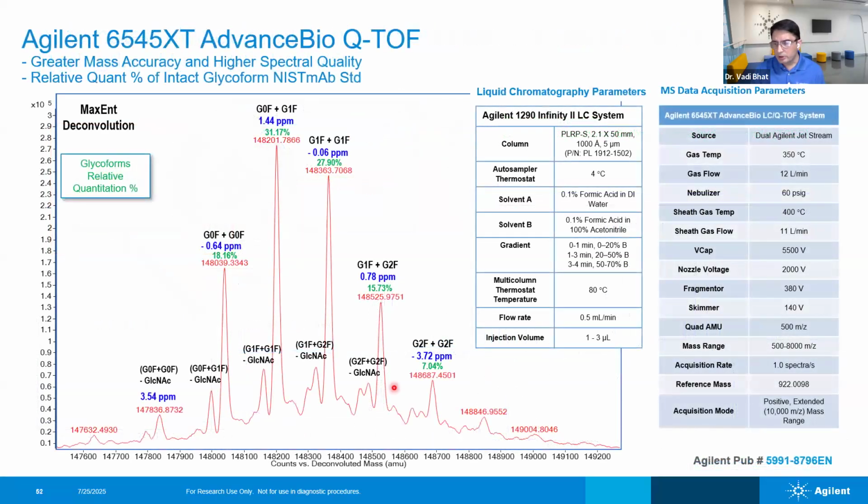Now, in the interest of time, I may skip some of these slides and go quickly, maybe in under 5 to 10 minutes. So essentially mass spec is very critical. I discussed some of this mass spec, but let me quickly go through a purely mass spec based approach.